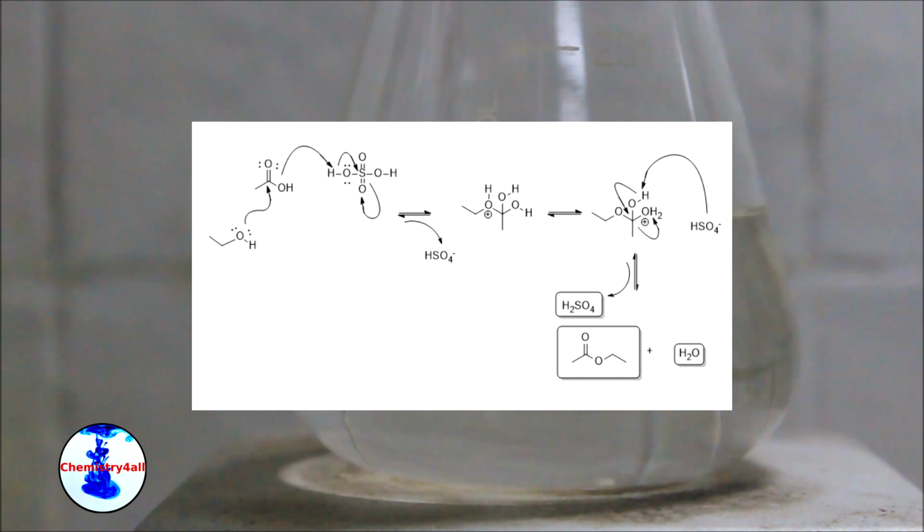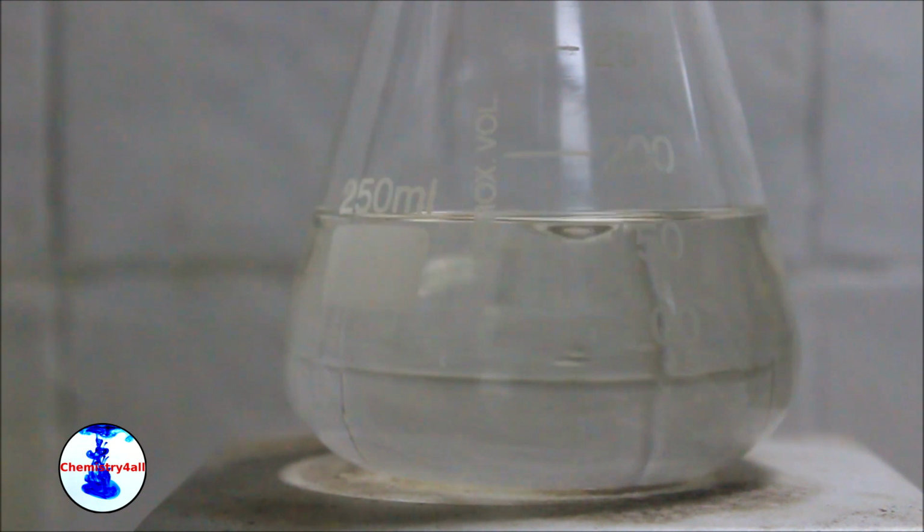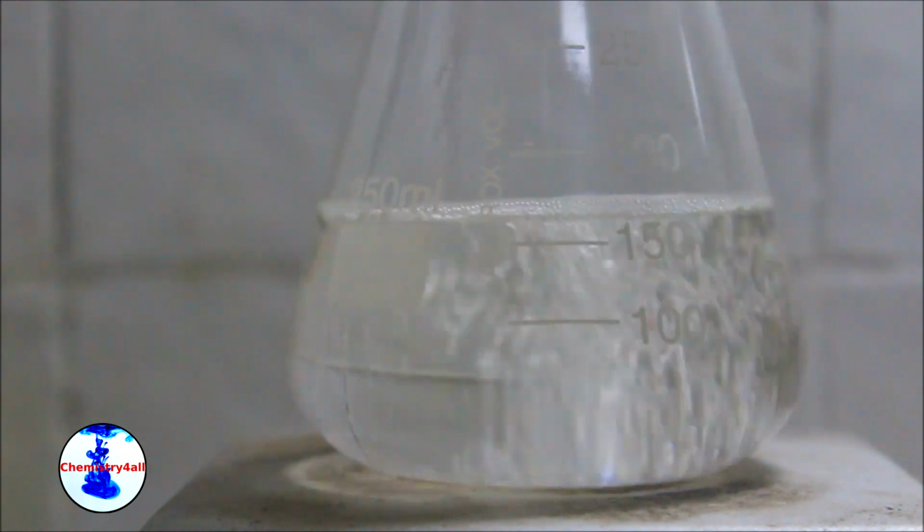Obviously, another way to solve this issue would be to remove one of the products, and usually the strategy involves getting rid of the water through different techniques, such as the use of a Dean-Stark apparatus. Anyway, let's go back to the experiment.